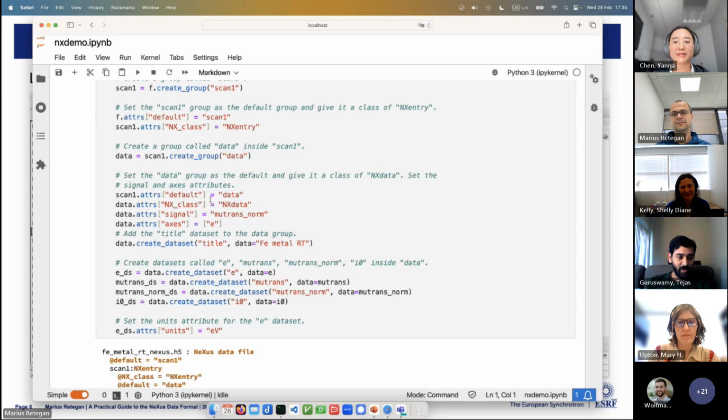I've got a question that's maybe a bit broader about defining new NX formats and what might be possible. For some of the new fluorescence detectors and applications, rather than storing simple 2D arrays of spectra, we want to consider storing information about each photon as it's coming in. Therefore, the structure is, at least in my mind, harder to define, because you've got a variable number of photons per channel with metadata associated with each photon event. Do you think we can define an NX style schema for this kind of data? Are you aware of any efforts like that?